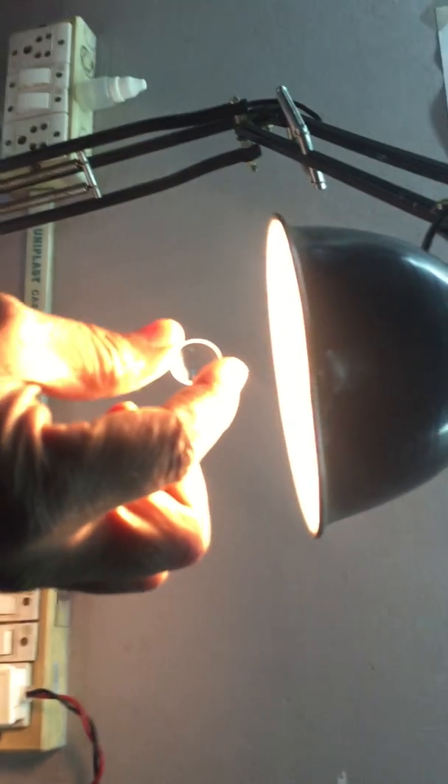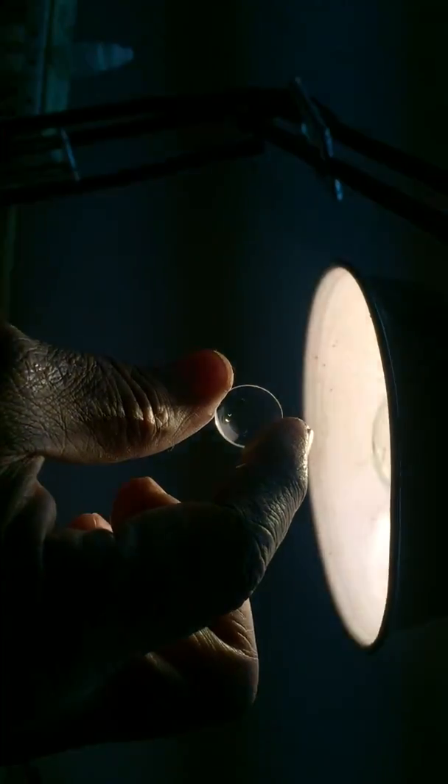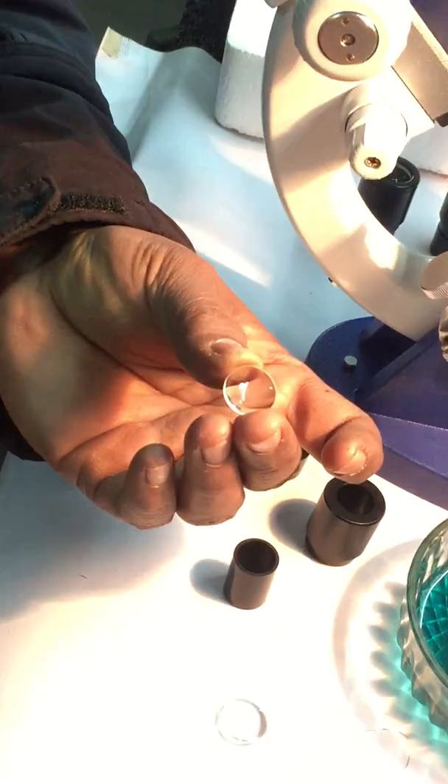Infection lens. Just open it. Okay, blower. Flat side up.